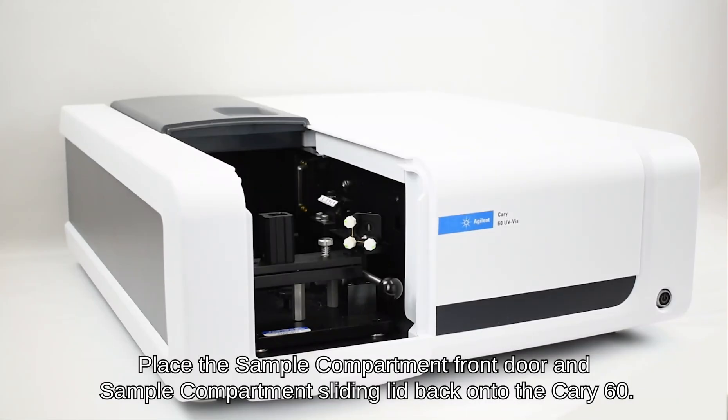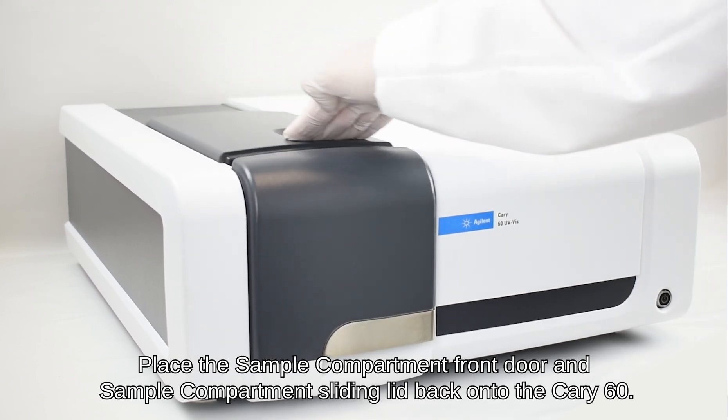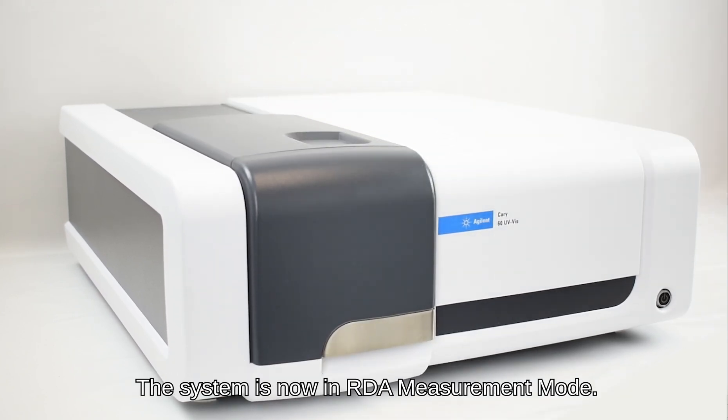Place the sample compartment front door and sample compartment sliding lid back onto the Carry 60. The system is now in RDA measurement mode.